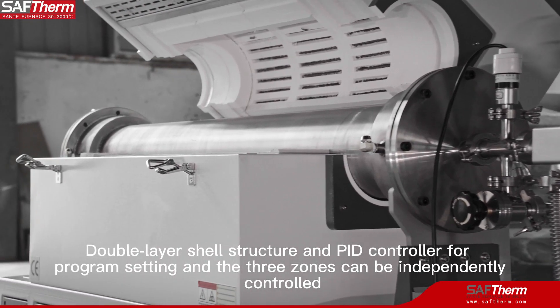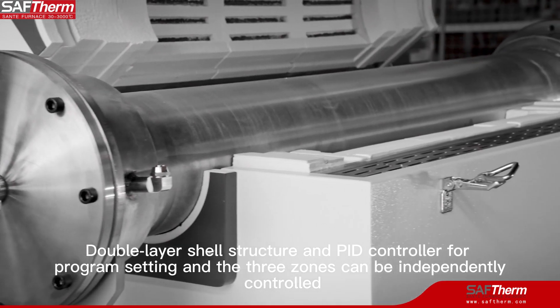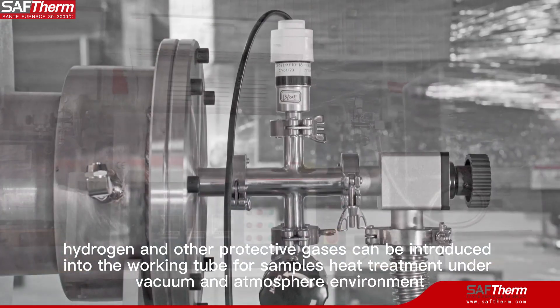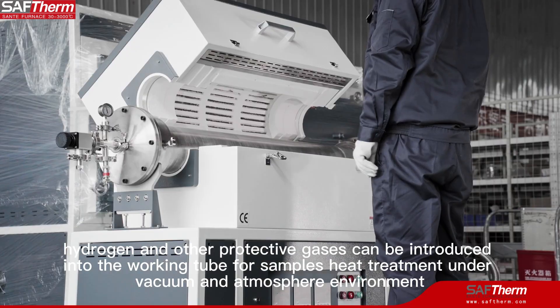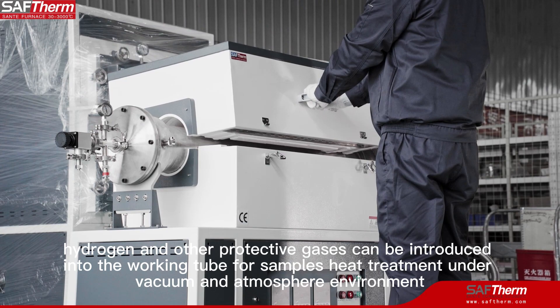Double-layer shell structure and PID controller allow program setting, with the 3 zones independently controlled. Nitrogen, argon, hydrogen, and other protective gases can be introduced into the working tube for sample heat treatment in both vacuum and atmosphere environments.